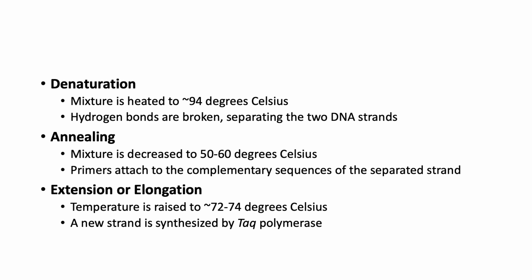And lastly, we have extension, otherwise known as elongation. During this step, the temperature is raised again to about 72 to 74 degrees Celsius. In this step, a new strand is synthesized by the enzyme Taq polymerase.